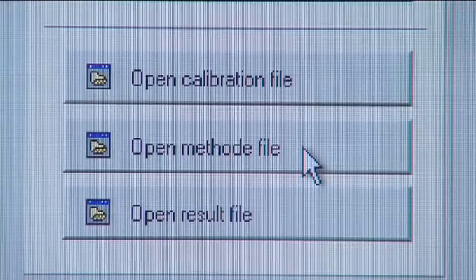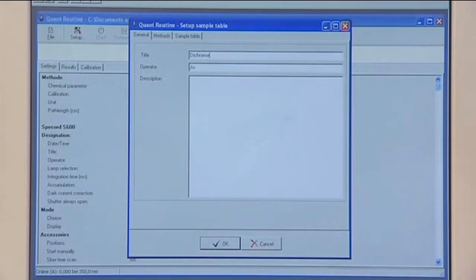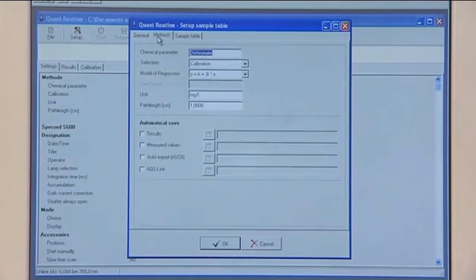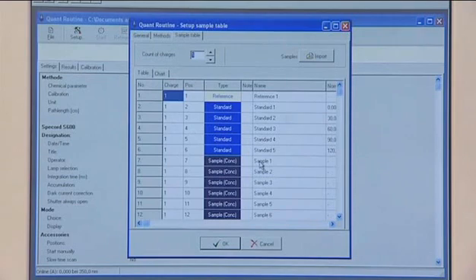The software offers a high ease of use for quantitative routine analysis. You can, for example, activate a former method, fill in sample titles and you are immediately ready to start. Standards can be measured contemporaneously as shown in the example. Already existing calibrations can also be used.